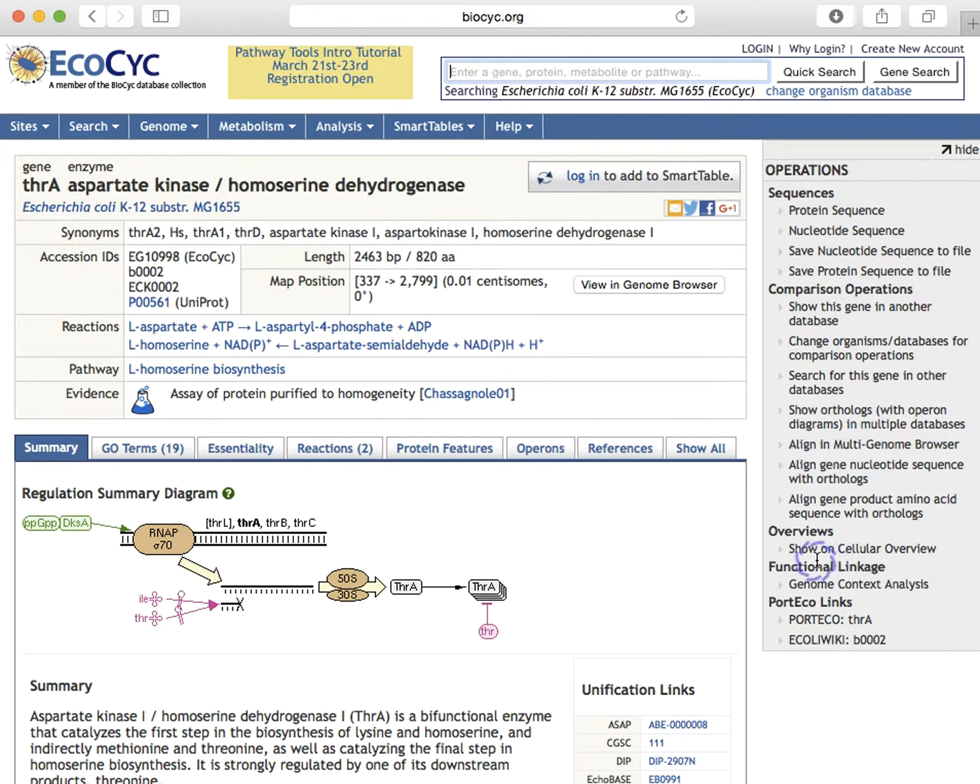The upper area is fixed in place and provides the gene names, synonyms, accession numbers, reactions, pathway, and evidence codes associated with this gene.